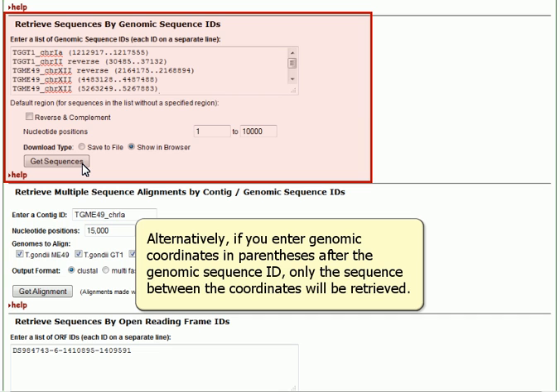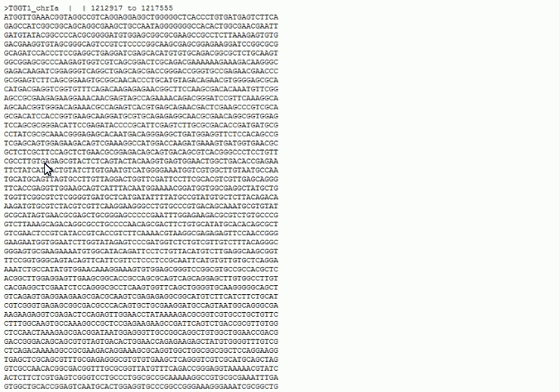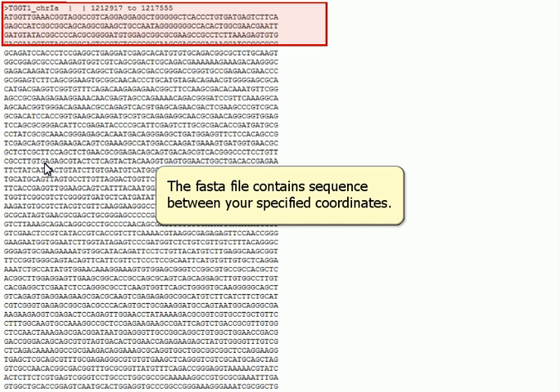Alternatively, if you enter the genomic coordinates in parentheses after the Genomic Sequence ID, only the sequence between the coordinates will be retrieved. The FASTA file contains sequence between your specified coordinates.